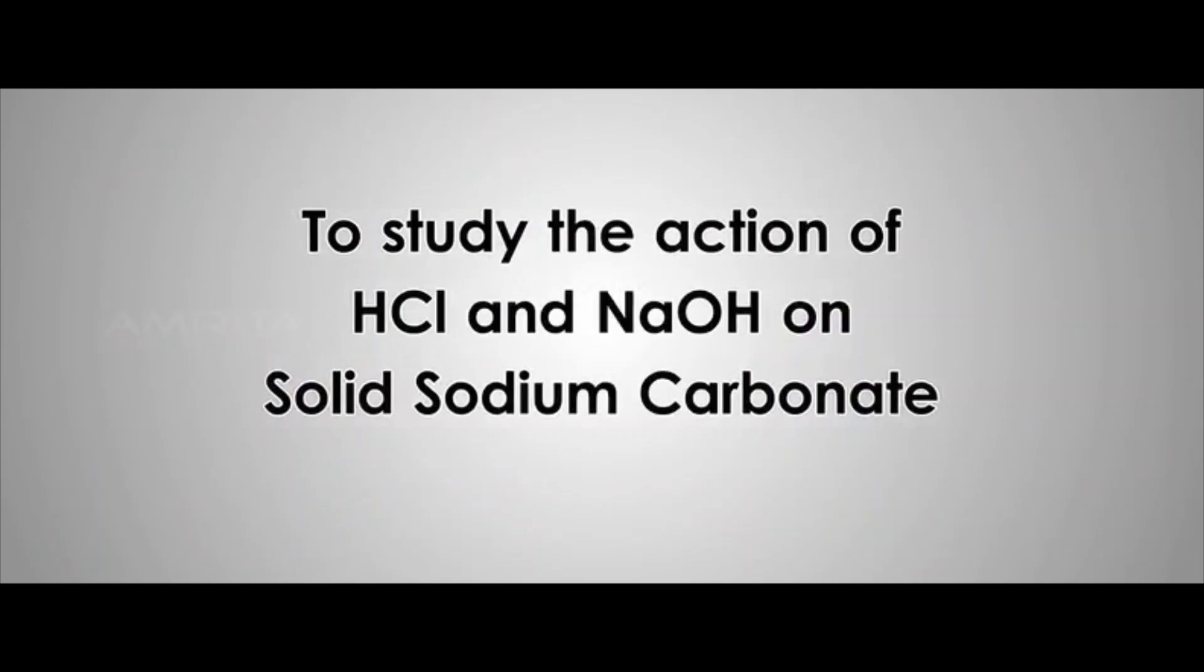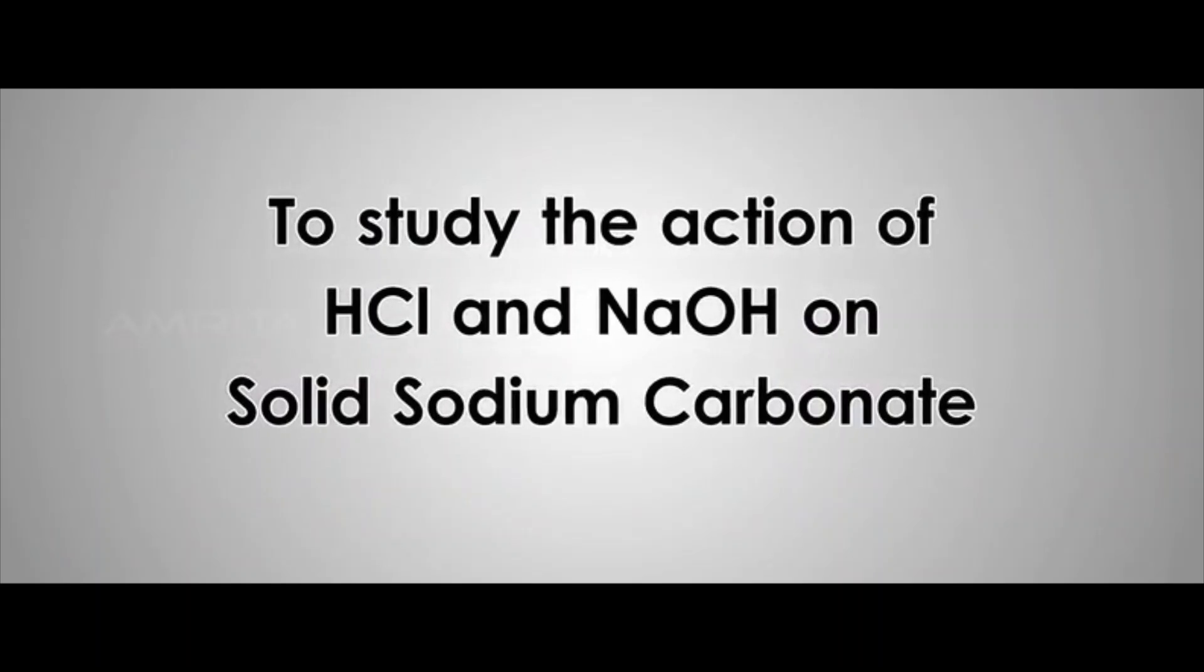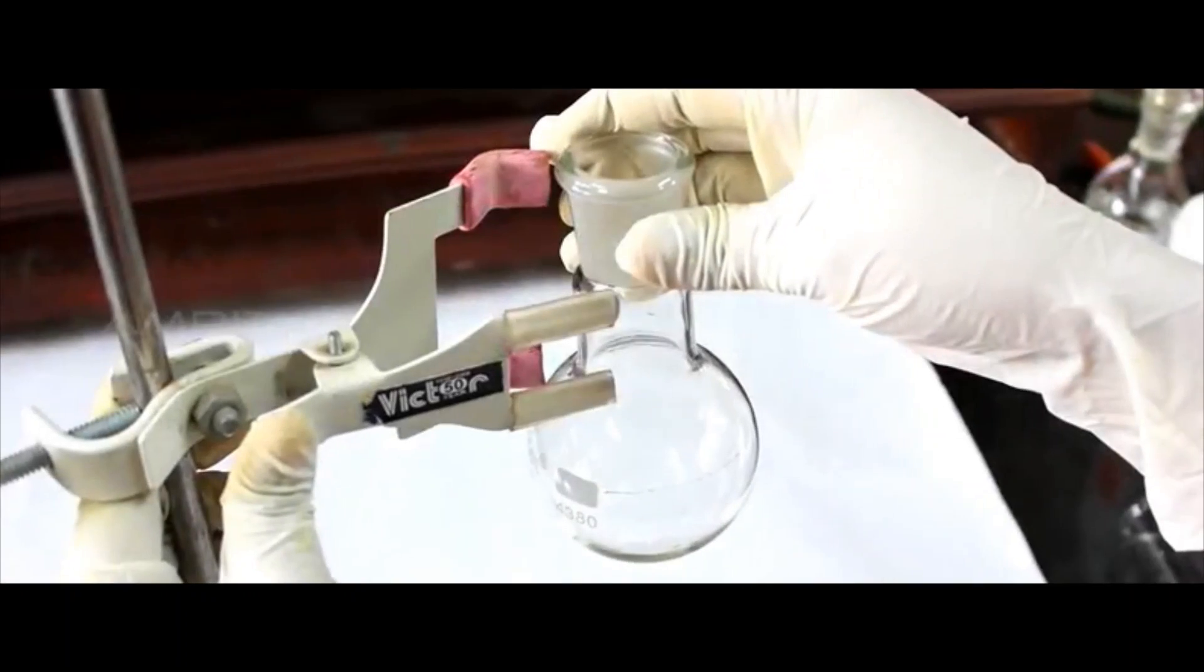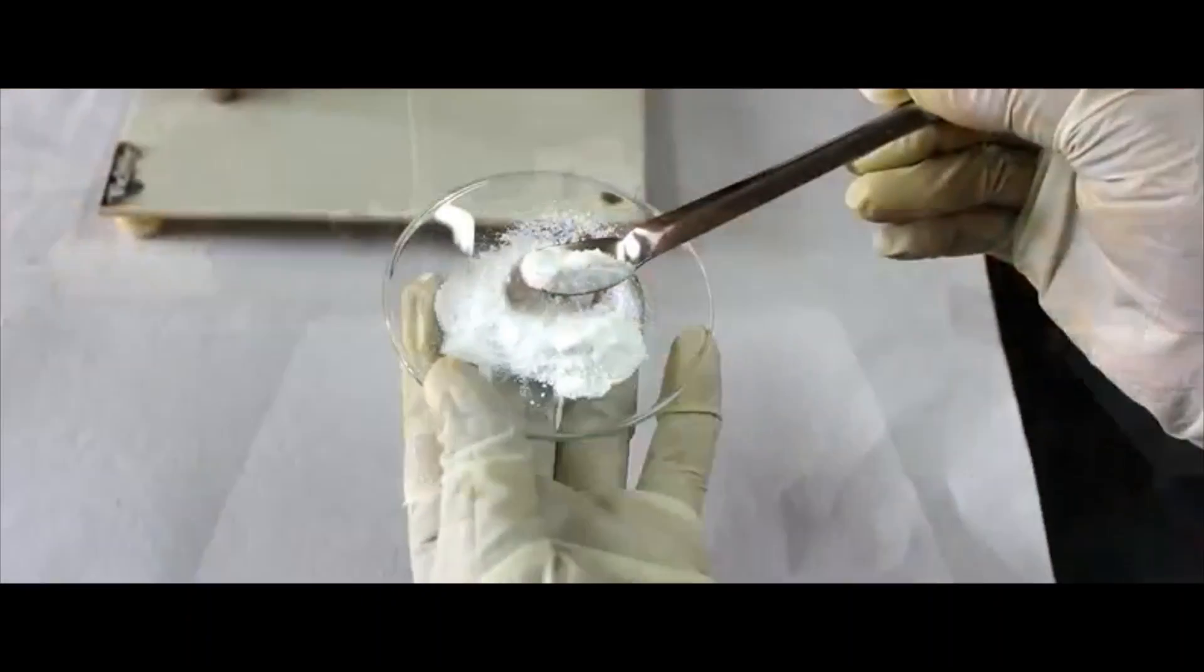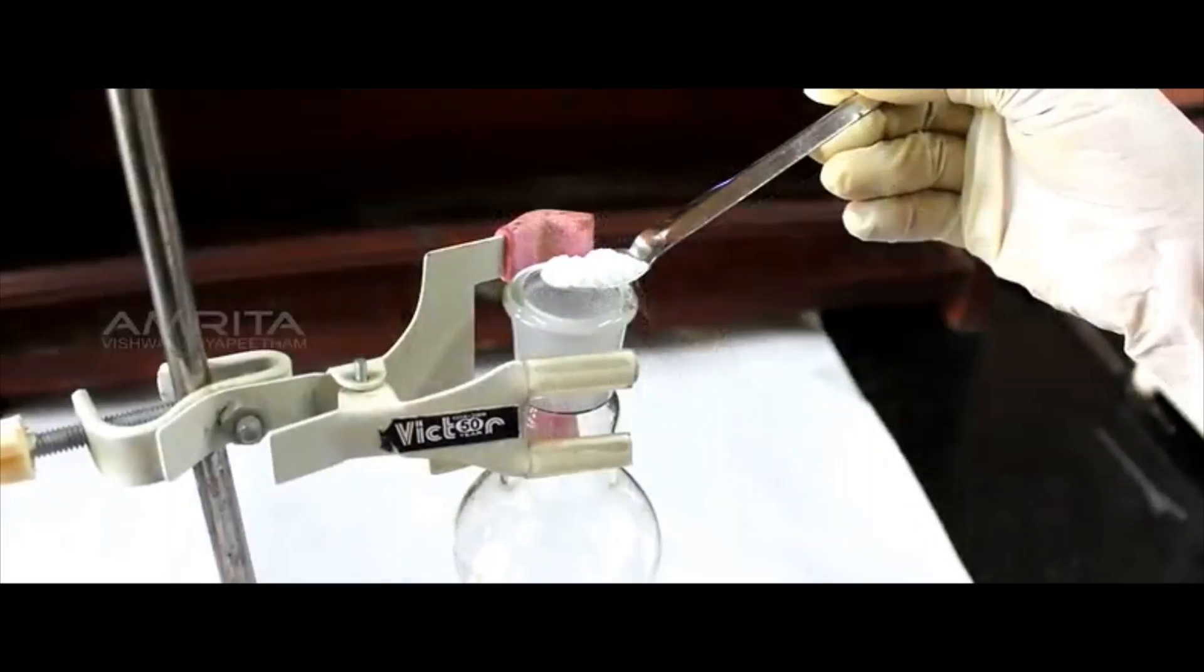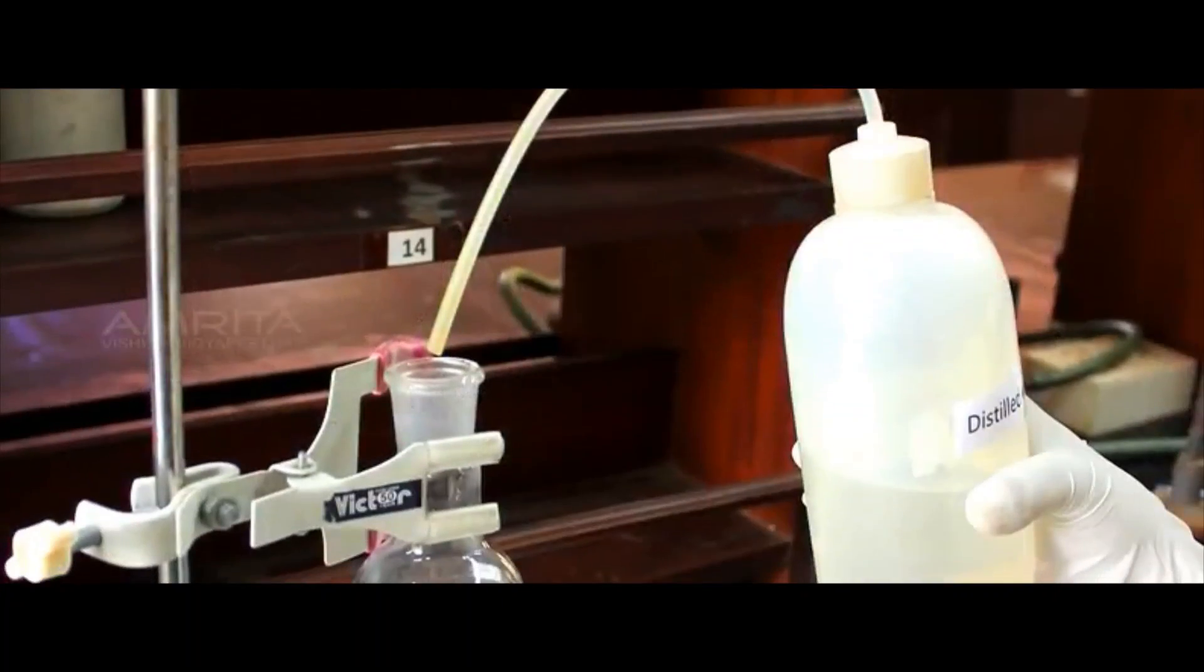To study the action of HCl and NaOH on solid sodium carbonate, first clamp the round bottom flask to the stand and add a small quantity of sodium carbonate and a few drops of distilled water into it.